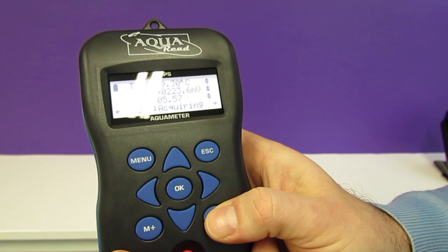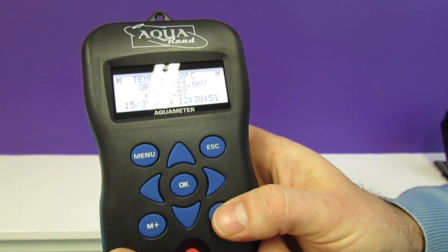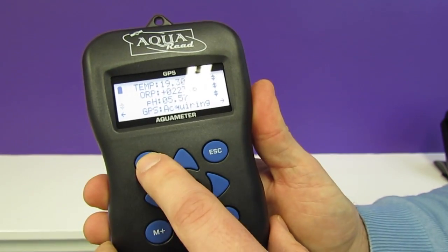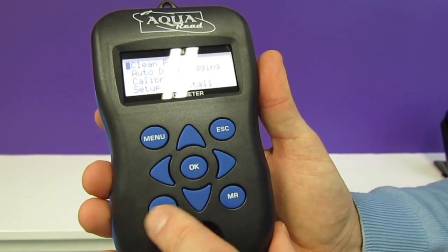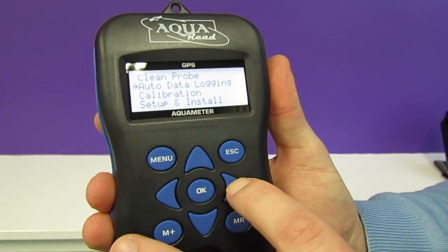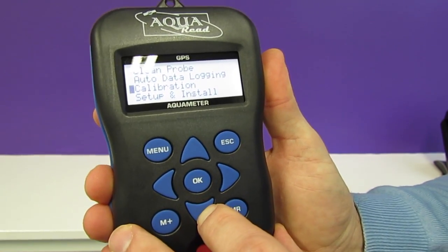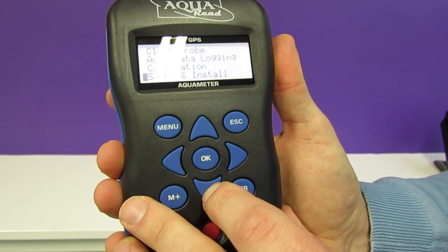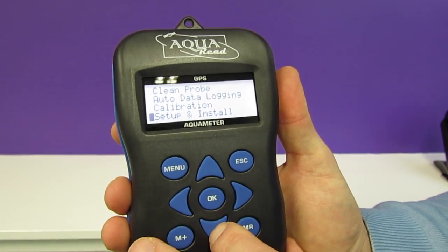You can press the memory recall button to view that data. The menu opens up a simple set of options which allow you to set up things like auto data logging, calibrate the meter and probe, and set up and install sockets depending on which AquaProbe you're currently using.